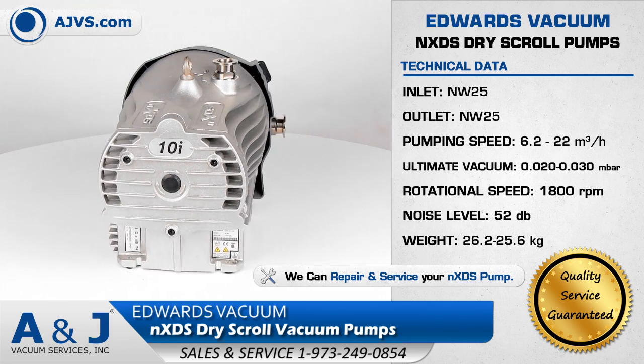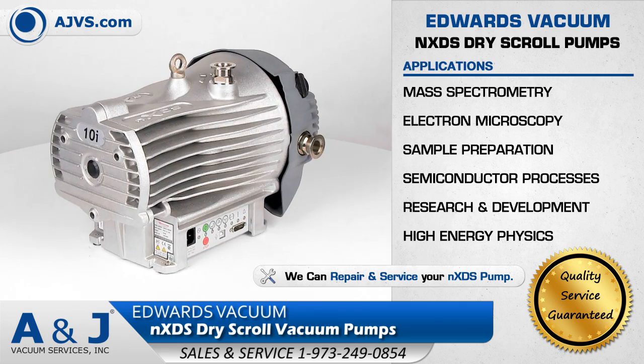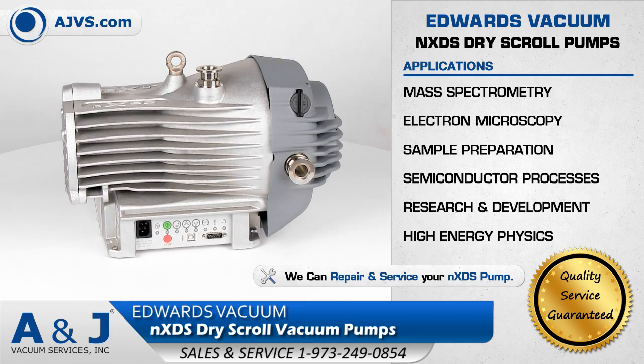The Edwards Vacuum NXDS Pump Series is a highly reliable and low-maintenance high vacuum solution for applications in research and development, electron microscopy, and high-energy physics.